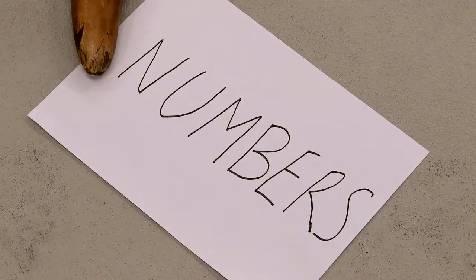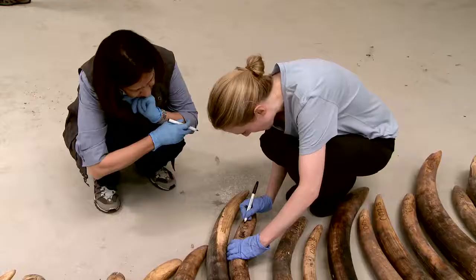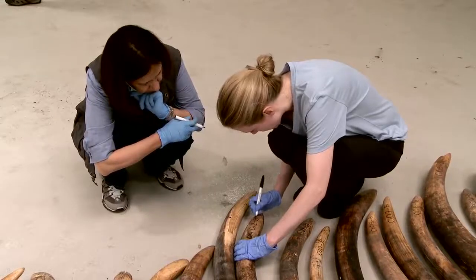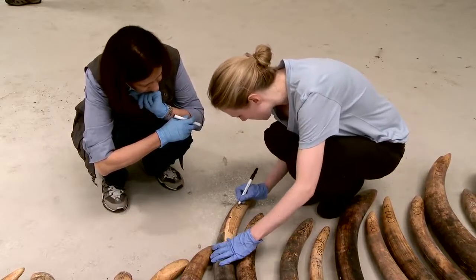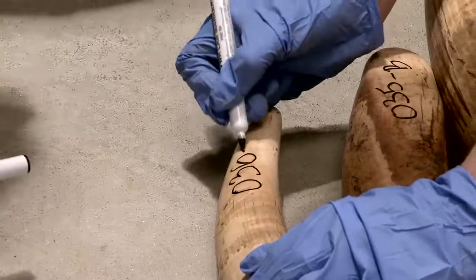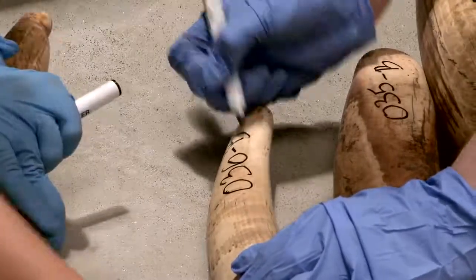Write the group letter directly on the tusk with a permanent marker, next to the tusk number. Now, every tusk should be marked with an individual number and its group letter. Write each tusk's group letter on the datasheet next to the tusk number.